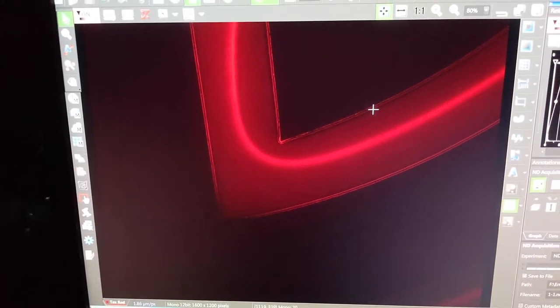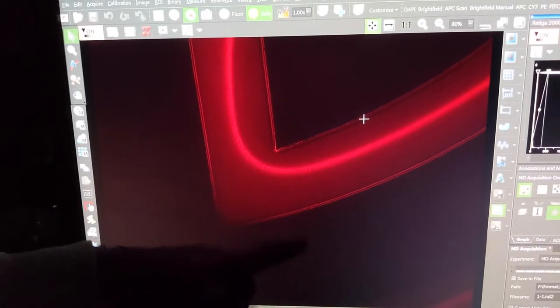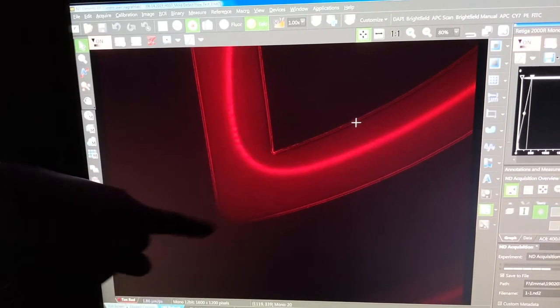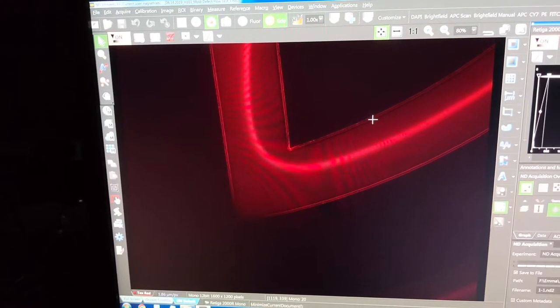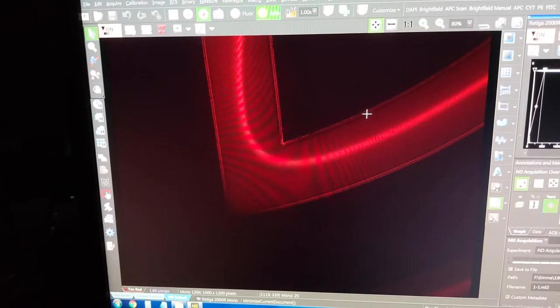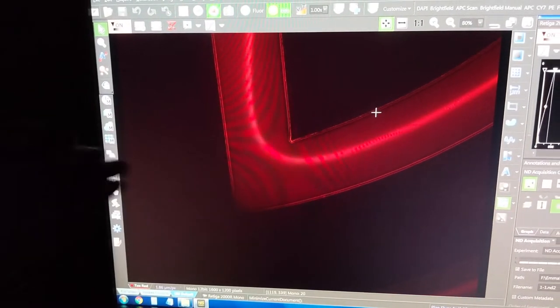Cool. So we have a labyrinth flowing, and what you're seeing here is one of the many corners in the labyrinth. And what you see is a really nice red line down the middle. Those are actually cancer cells. As the cells flow through the labyrinth maze, for lack of a better word, the cells will focus into a really tiny streamline. And so we're able to collect these really purely from a patient.